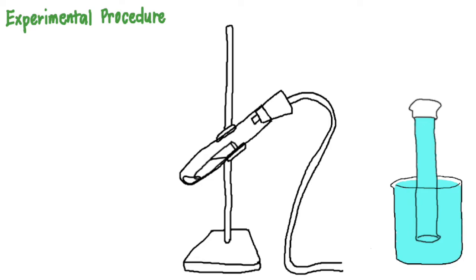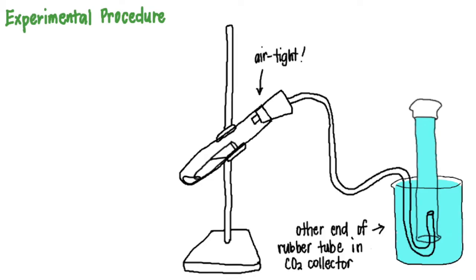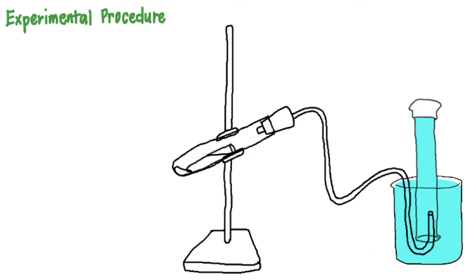Replace the cork stopper into the big test tube. Check the connections if they are airtight. And then slowly adjust the angle of the big test tube so that the hydrochloric acid from the small test tube can flow to the calcium carbonate. You will observe bubbles forming, and then the gas will start to displace the water inside the graduated cylinder.